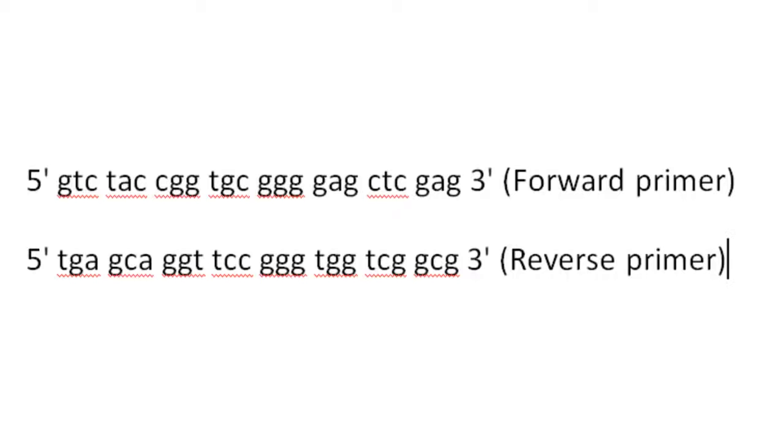That's how you design very simple PCR primers, not taking into consideration whether this is going to be used for cloning or not, because we're not inserting any restriction enzyme sites, or doing this for homologous recombination, for example. So this is just, for example, when you want to create primers and amplify a segment, maybe for a confirmation. If someone gives you a plasmid and you're not sure if that target sequence is in there, you can download the sequence, design primers to target the specific sequence, and then run your PCR and see, well, okay, is it actually there or not?